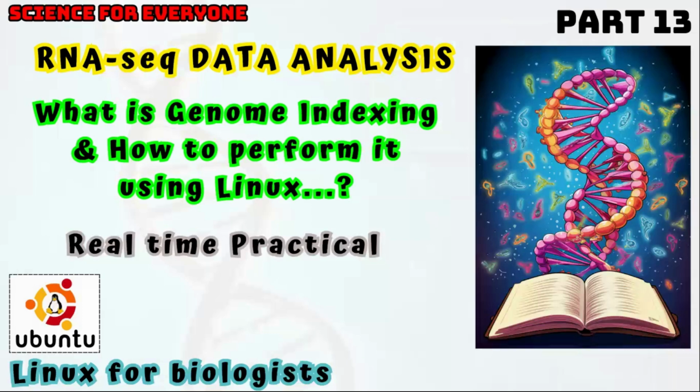Today, the video is related to RNA sequencing data analysis, and the title of today's video is What is Genome Indexing and How to Perform it Using Linux Operating System. As you all know, I have started a video series related to RNA sequencing data analysis, and this is part 13 of that series. I'm really thankful to you that you are supporting this series and giving a positive response to it. So basically, I will perform genome indexing in this video. It will be a real-time practical.